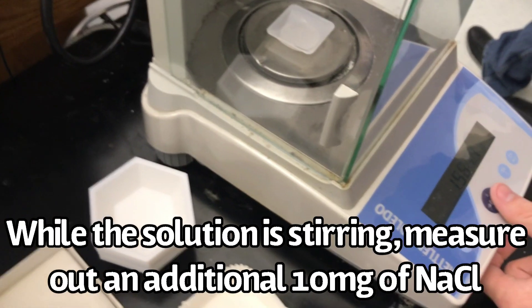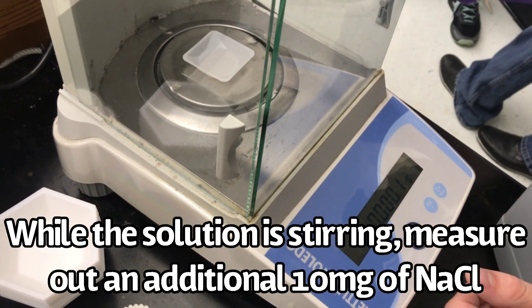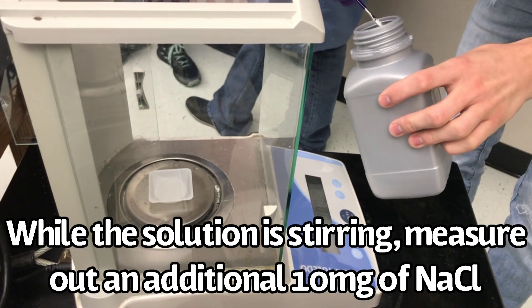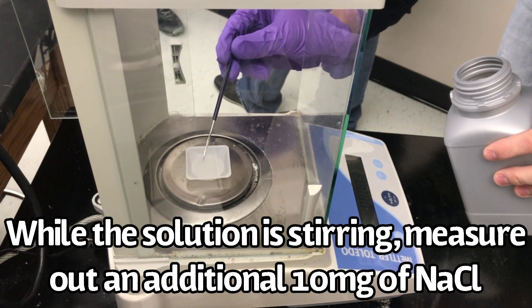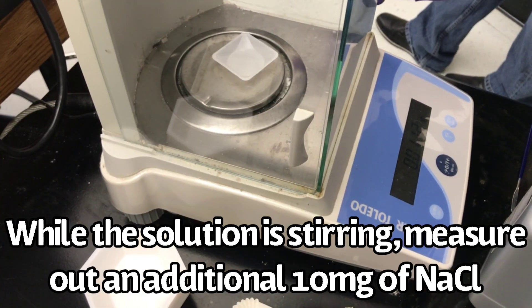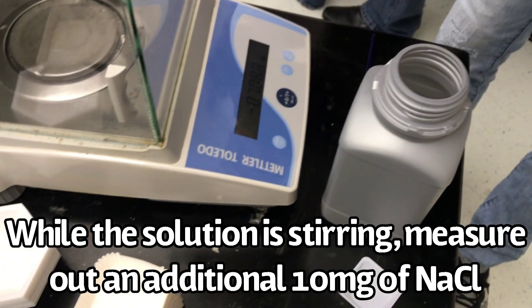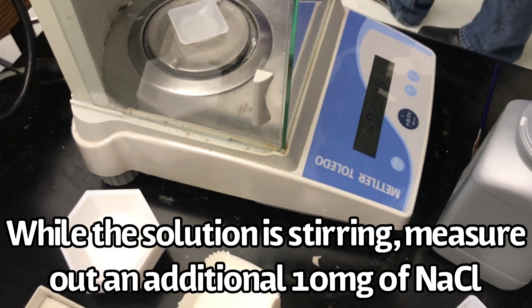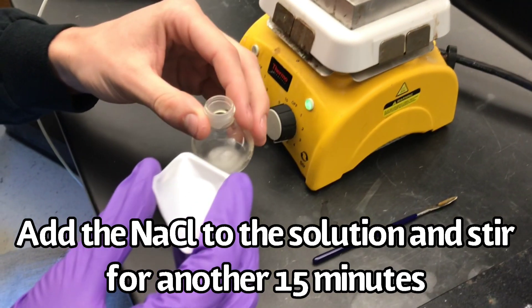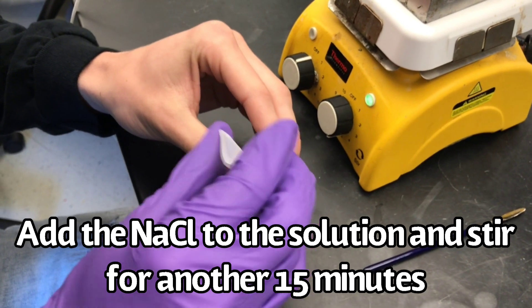While your solution is stirring, measure out an additional 10 milligrams of sodium chloride. After the 45 minutes are up, add the sodium chloride to the solution and stir for an additional 15 minutes.